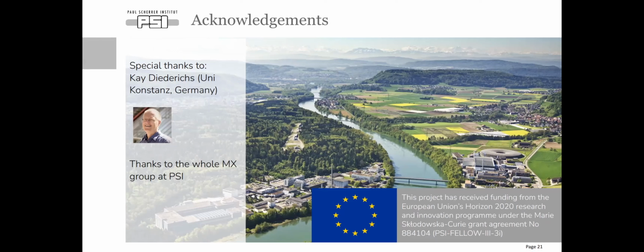I would have a look at CC half, and check that you compare it at the same resolution bin. Then also look at the other statistics and decide what you actually want to look for. See what you get when you merge your data.